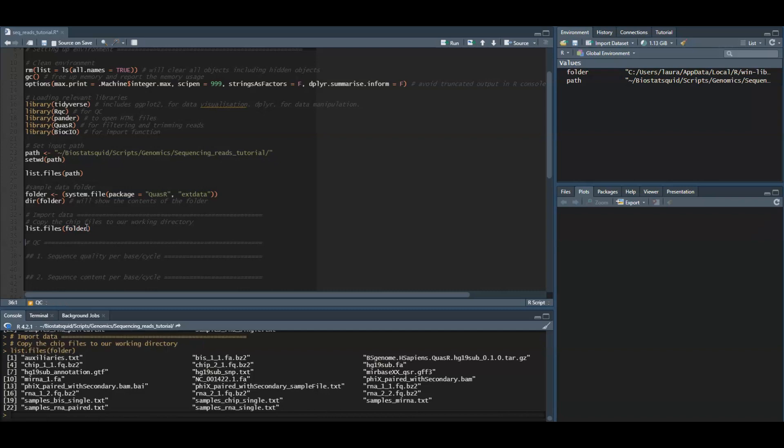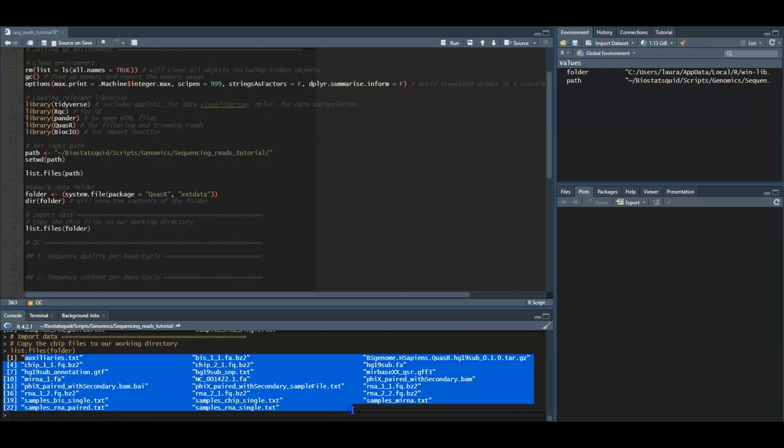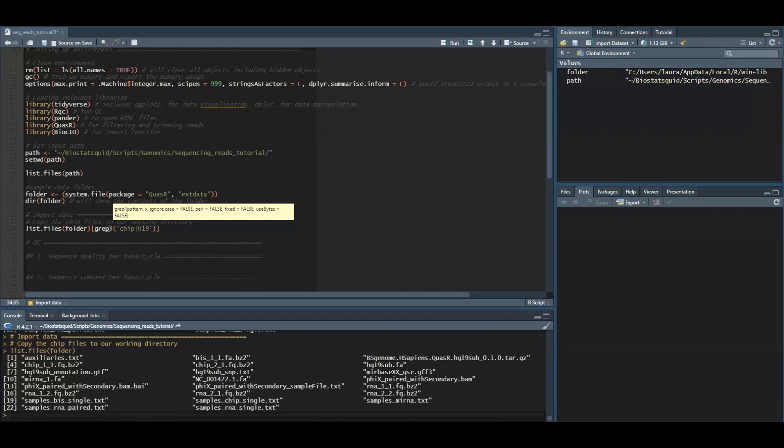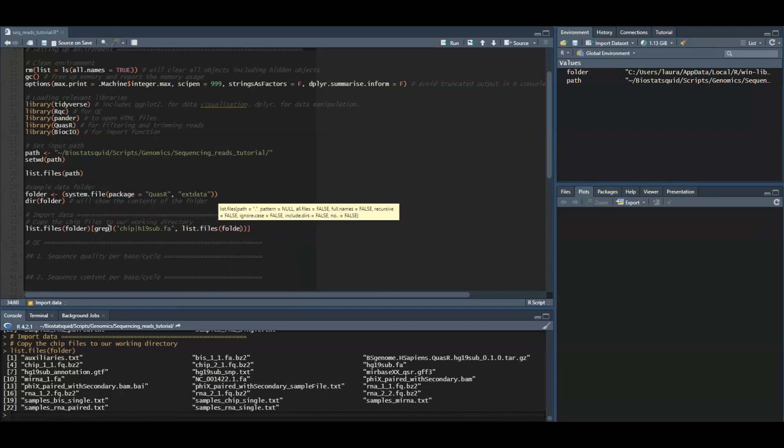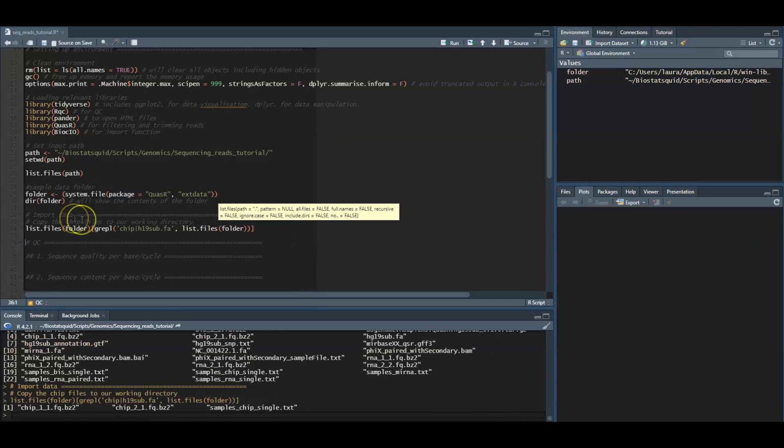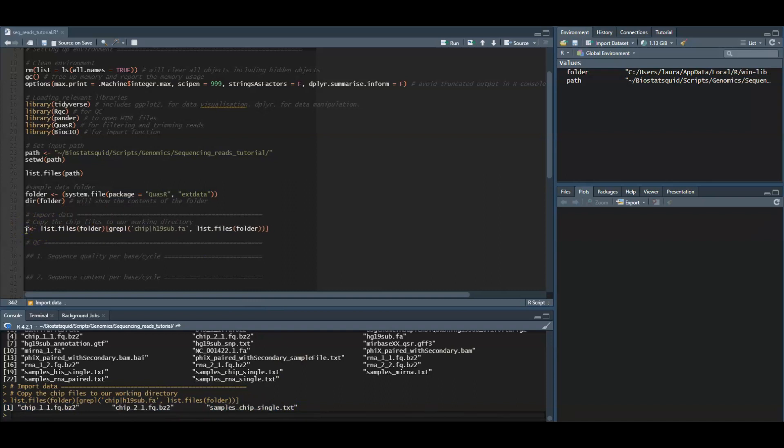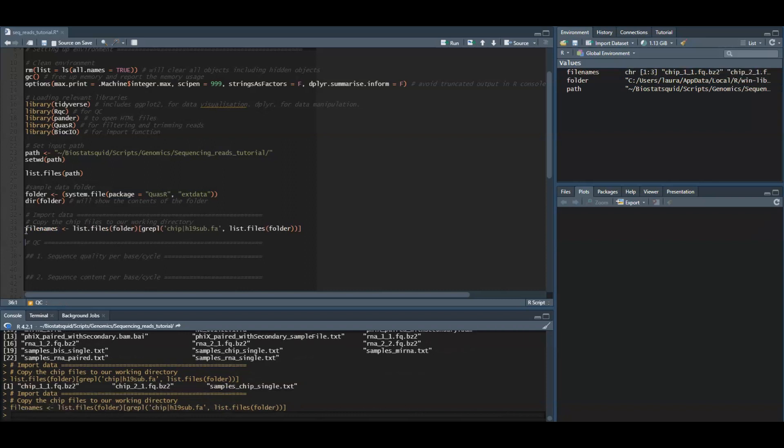We will only subset or select a few of them. We will need the ChIP files and we will also need this file for the alignments. These are the three files you need. You can go ahead and just copy them manually if you want, otherwise we will assign them to this object called filenames.